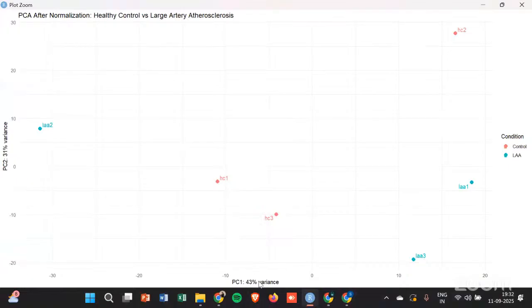It's not exactly what that means, but you can at least get an idea. It means that roughly 43% of them will be separated out from each other. Similarly here for the y-axis as well.